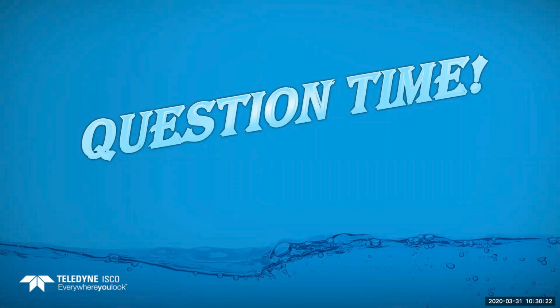Yeah, your suction line that runs to the source, you can't really cover that up all the time. So if you can run that underground and in conduit, that helps keep them from tampering with that as well. You just want to get it so they can't have access to anything like that. It's a very good idea. So pretty much however you want to do it and get it so nobody can touch it is usually okay.